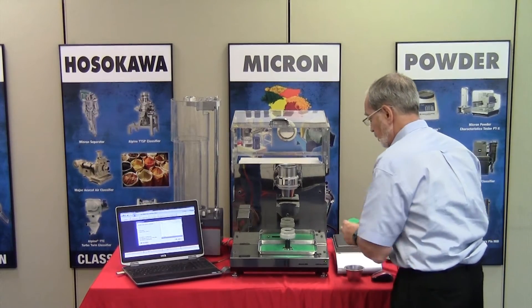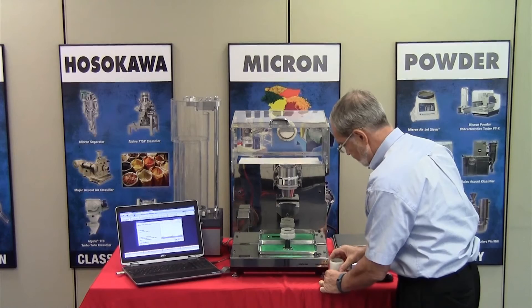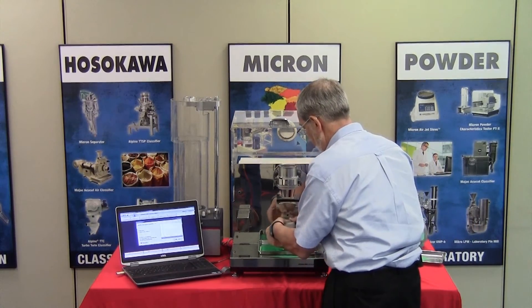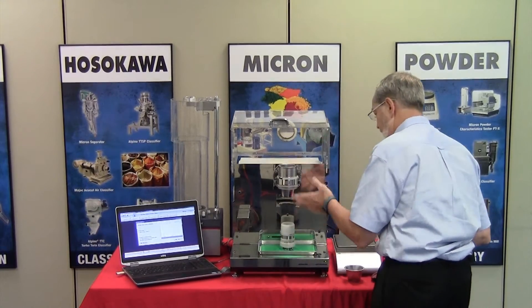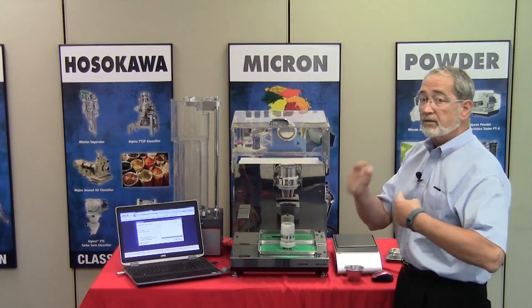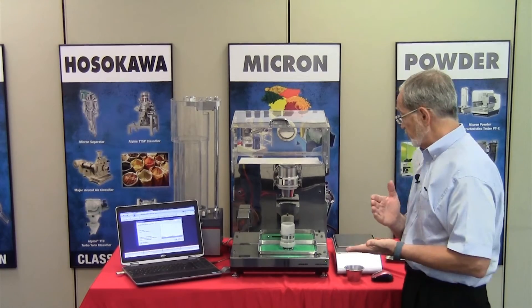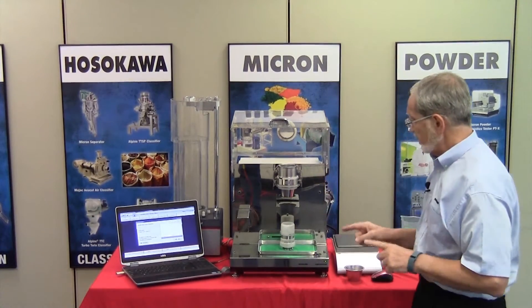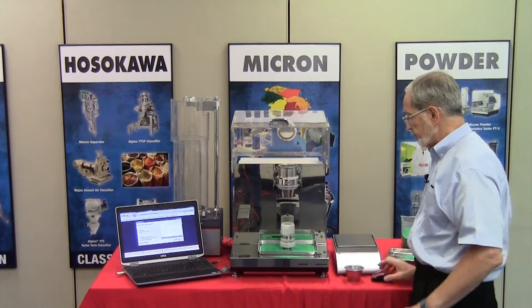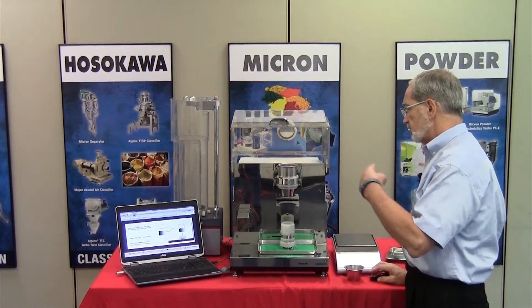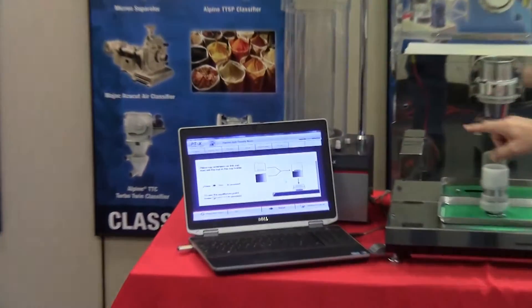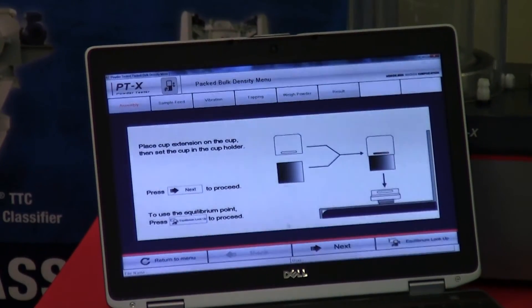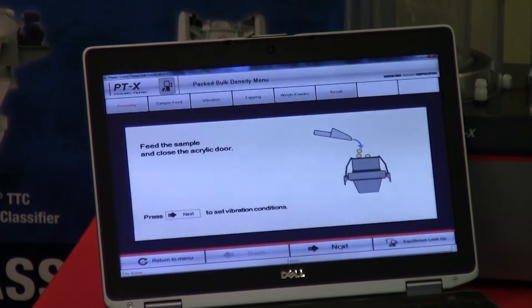To proceed, we place the cup extension on the cup. There's no need to refill the cup; however, the software will advance to that point because we're going to tap the sample. There are two ways of filling the cup. Pressing next advances, and as indicated we put the cup extension on, press next, and it takes us to the feeding option. You can either feed through the instrument as before, or manually feed it.